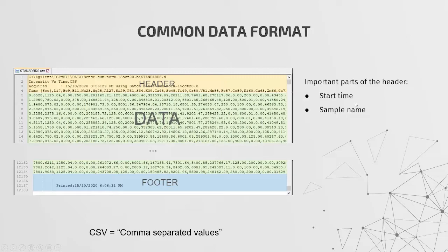A sample name is also good so the user can understand and contextualize where these data come from. You can show that sample name in Iolite so that you can look for it, that type of thing. So it's handy, not essential, but it is handy. And the channel names, we need to know what each of these are. In this case, it's on line 4, and the Agilent file is quite handy like that. However, there are some data files that don't have channels in them, and we'll be using that actually in our example today so that you can see how you can put them in if they're not in the header.